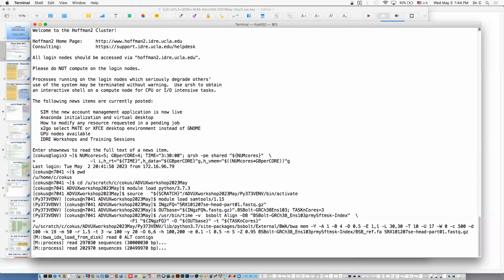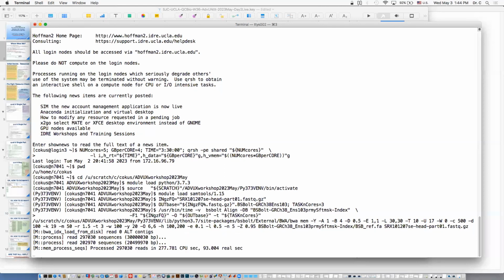Because specifically you want to target something like half an hour or an hour as a runtime. You would just extrapolate, right? You run this. We know that yesterday it took like 4 minutes or 4.5, maybe 5 minutes for this thing. And we just saw the startup phase is like a minute or something. So maybe 500K reads is 4 minutes. That means 1 million reads would be 8 minutes, and 10 million reads would be 80 minutes, an hour 20, right? So that already tells you that you should probably aim somewhere around 10 million reads or something, if you were trying to actually dial it in. So that's how you would dial in the time, right?